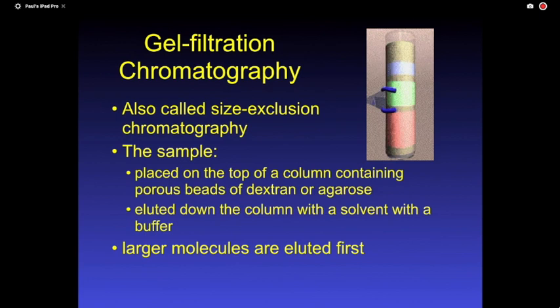And so what does that mean? You try again with something else. Okay? And so you place your sample on, and in this case, the running buffer and the elution buffer are exactly the same. And so it's just volume of buffer going through that will push everything through. We're not sticking like we're going to do with the others. We're just falling through.